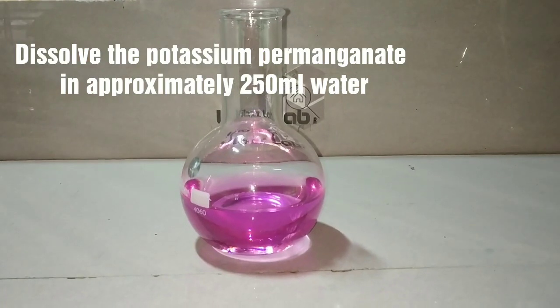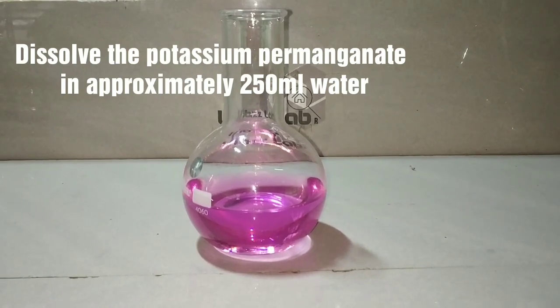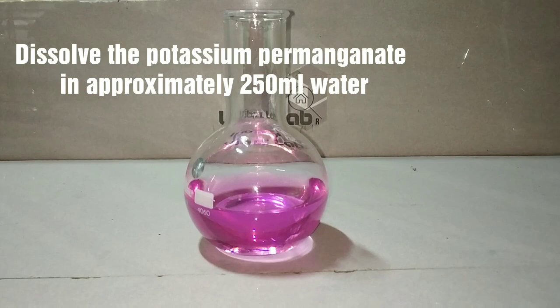We first dissolve potassium permanganate in about 250 milliliters of water. The solution should be diluted — only then the color change will be evident.